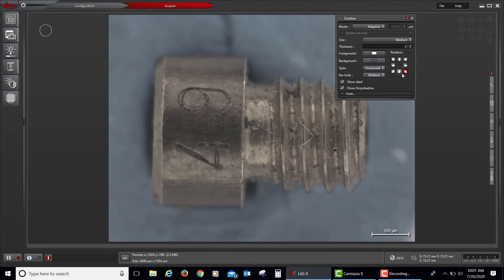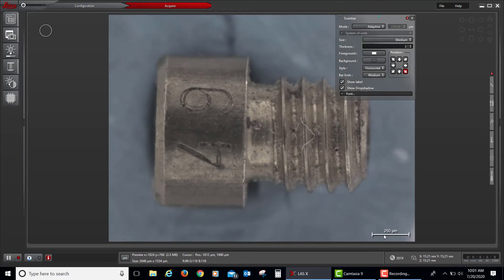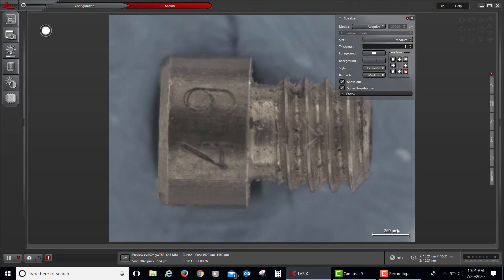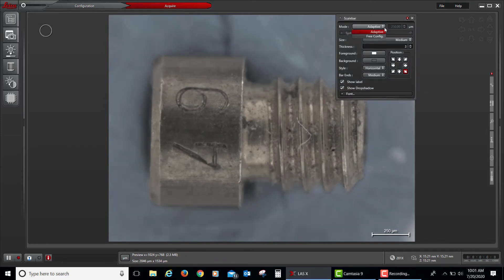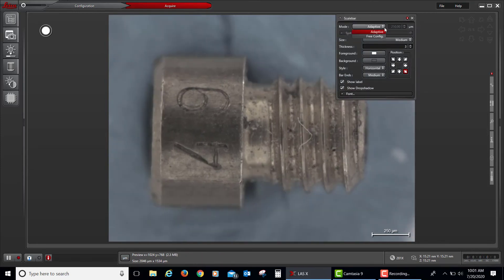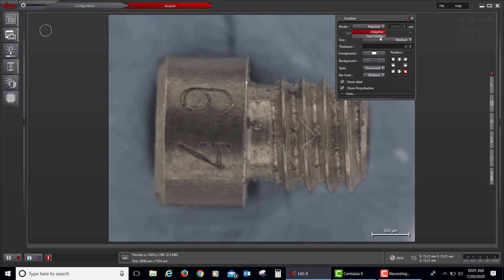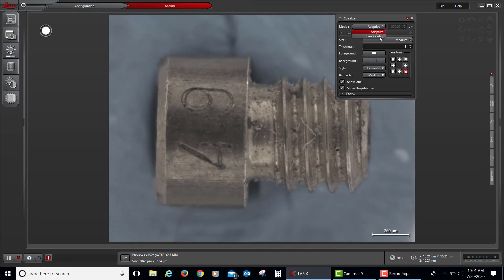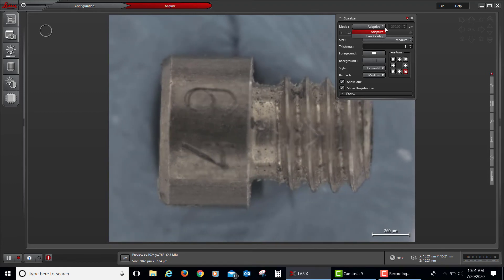By default, it is always about the same distance on the scale bar, but the numbers change as your magnification changes. Conversely, the operator can change that to free configuration where they can dial in whatever distance is desired.